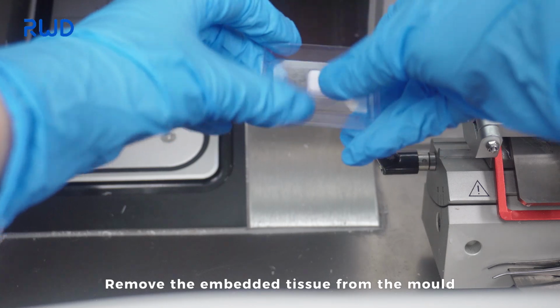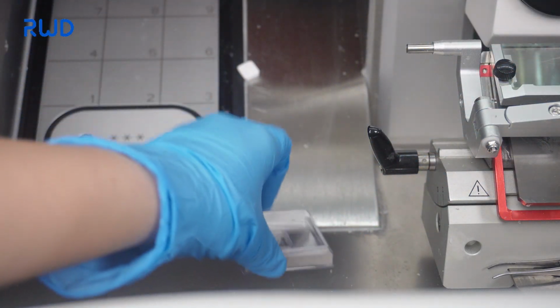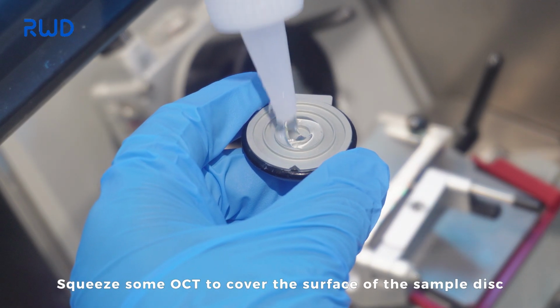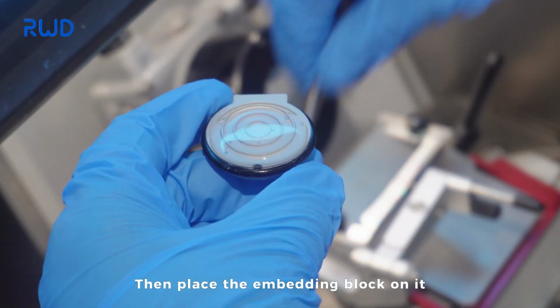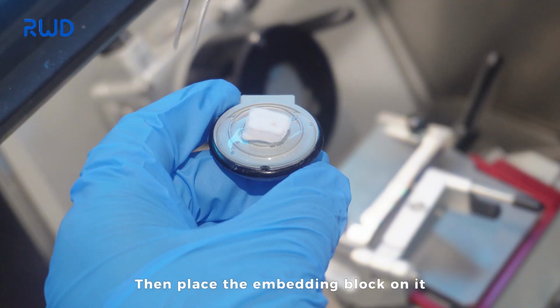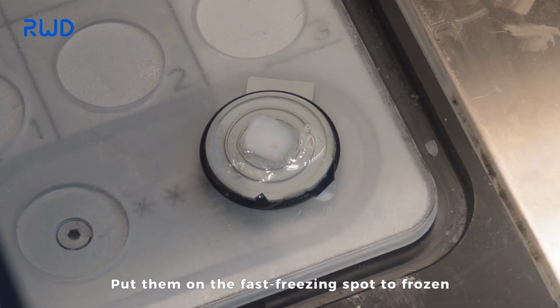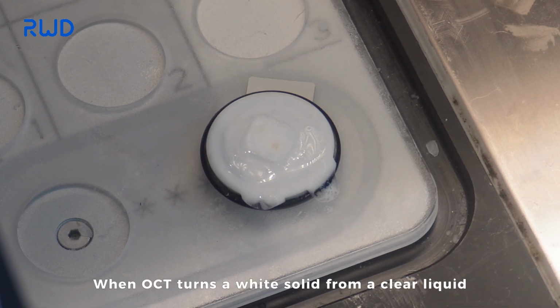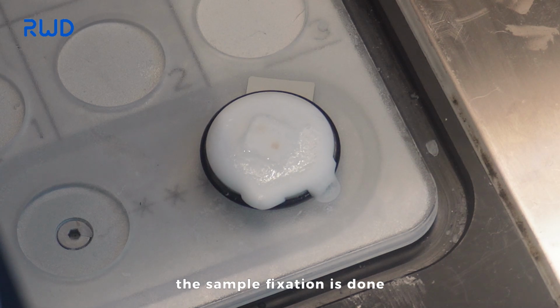Remove the embedded tissue from the mold. Squeeze some OCT to cover the surface of the sample disc. Then place the embedding block on it. Put them on the fast freezing spot to freeze. When OCT turns a white solid from a clear liquid, the sample fixation is done.